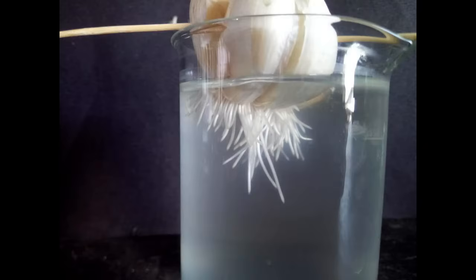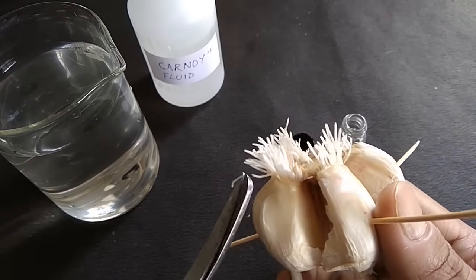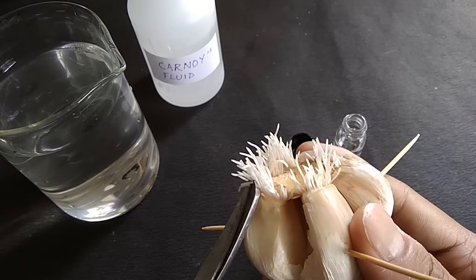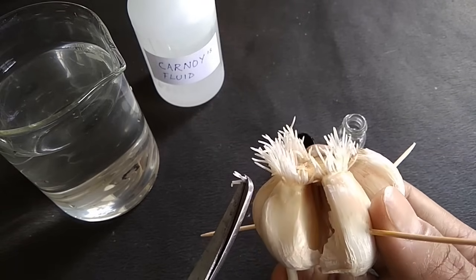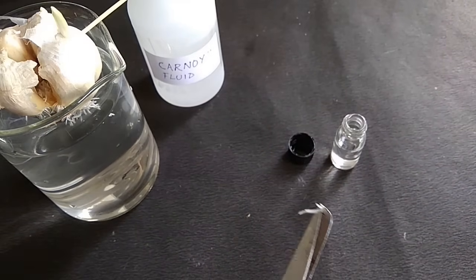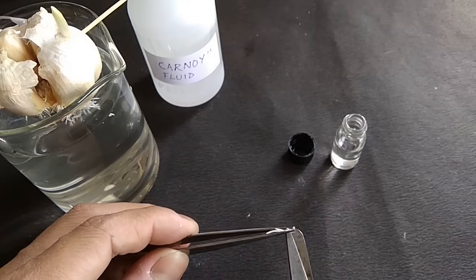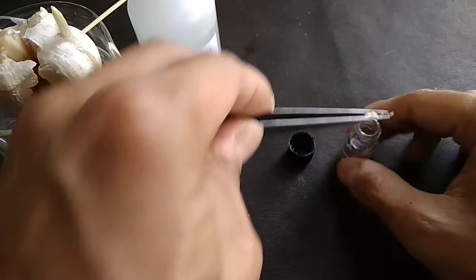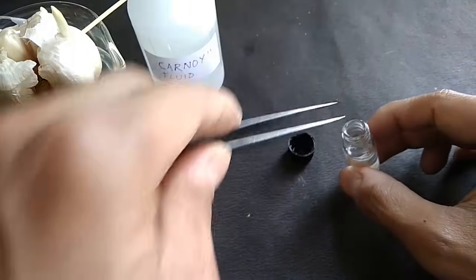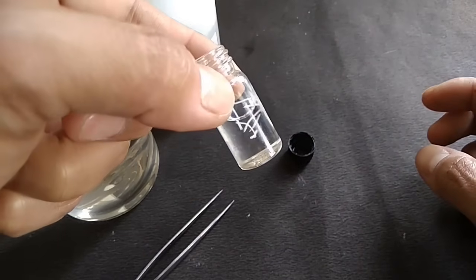Once the roots have grown about 2 to 3 centimeters, cut out 1 centimeter of root tips and transfer them into a tiny vial containing Carnoy's fixative fluid. Carnoy's fluid fixes the DNA of the root tip cells. Leave the roots in the fixative for about 48 hours. If you're planning on storing the root tips for longer, you may transfer the fixed root tips into a second vial containing 70% ethanol. Ethanol dehydrates the root tissue and thereby preserves DNA. Root tips preserved in ethanol and preferably refrigerated will keep well for a couple of years for genetic studies.